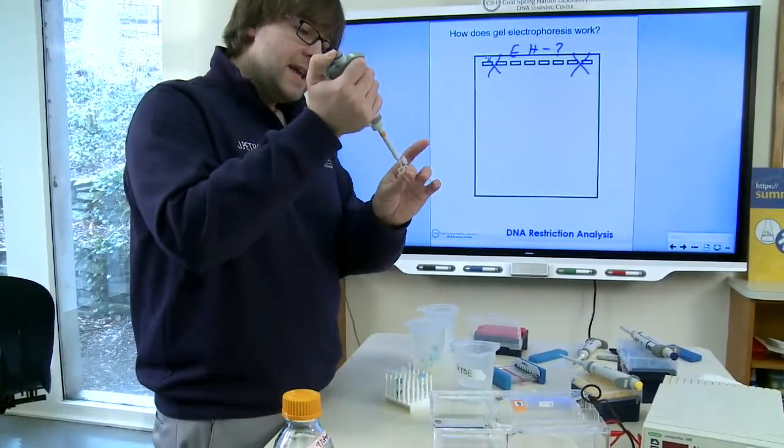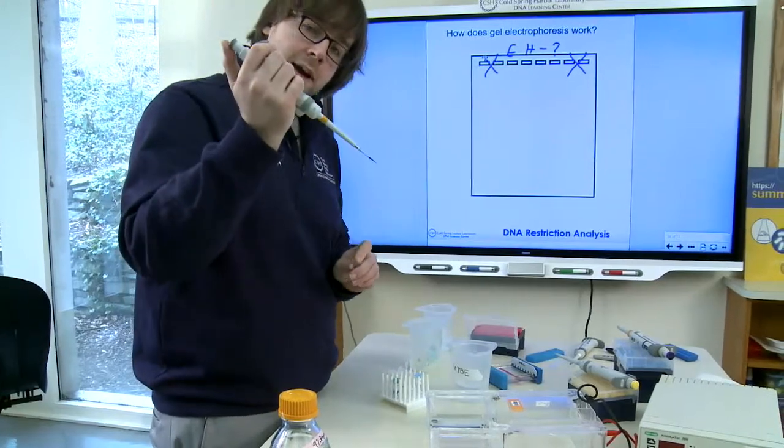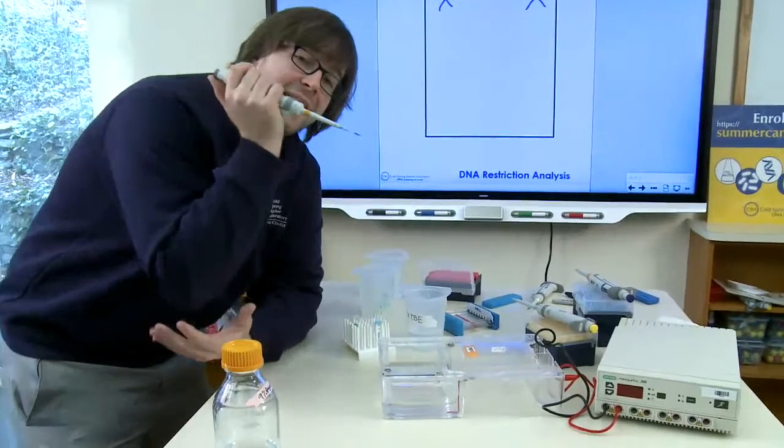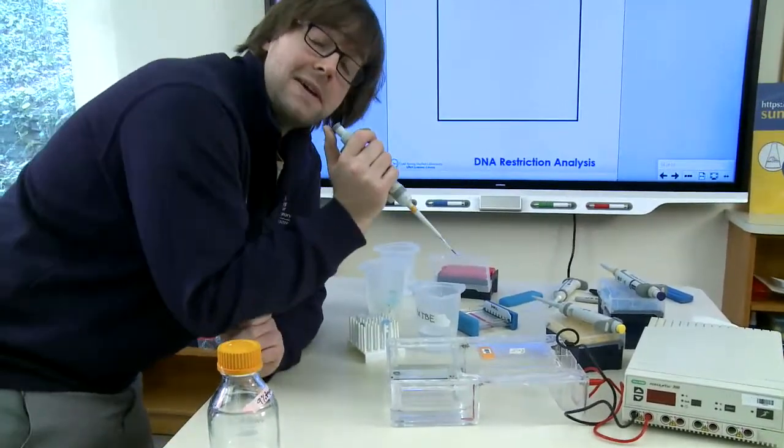So I'm going to start with my E tube here. Okay, I take my 10 microliters. That tube is garbage at this point. And when you're loading a gel, it's a pretty difficult thing to do, especially if you've never done it before.